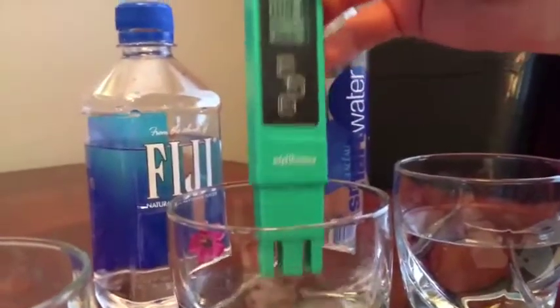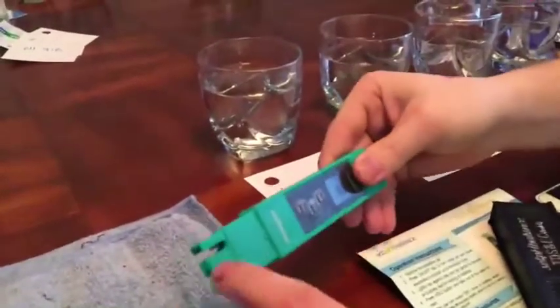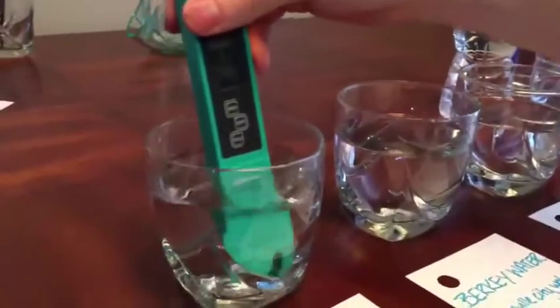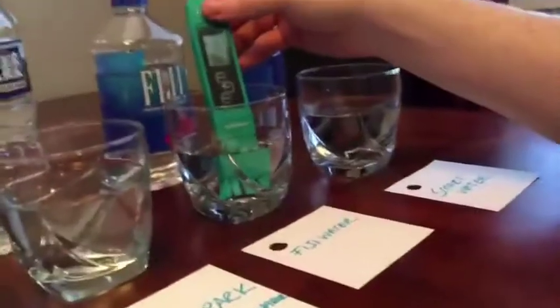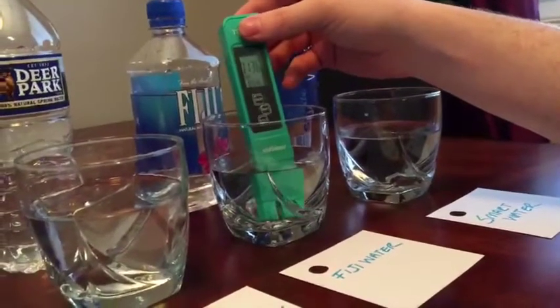So I just used this on the rag. Okay, let's just double check. I'm going to dampen it. I don't want to touch the prongs with it. All right, let's try it again. We're still reading in the 36 range, 35. Okay, let's go back to Fiji. 134, 135, 136 parts per million dissolved solids.